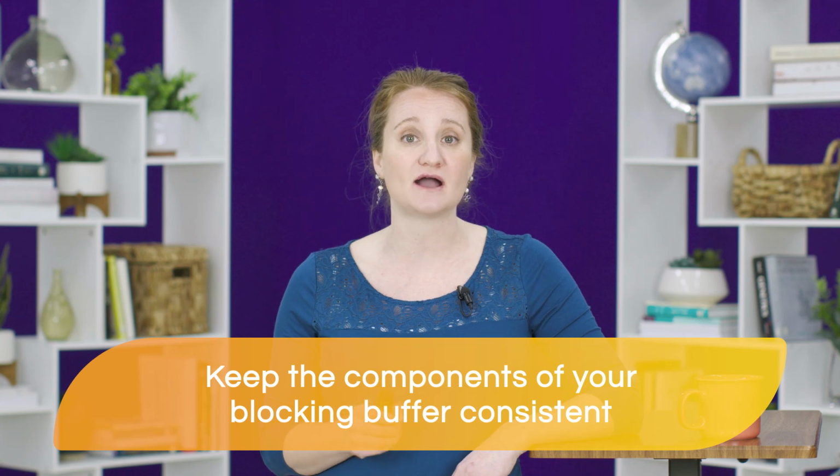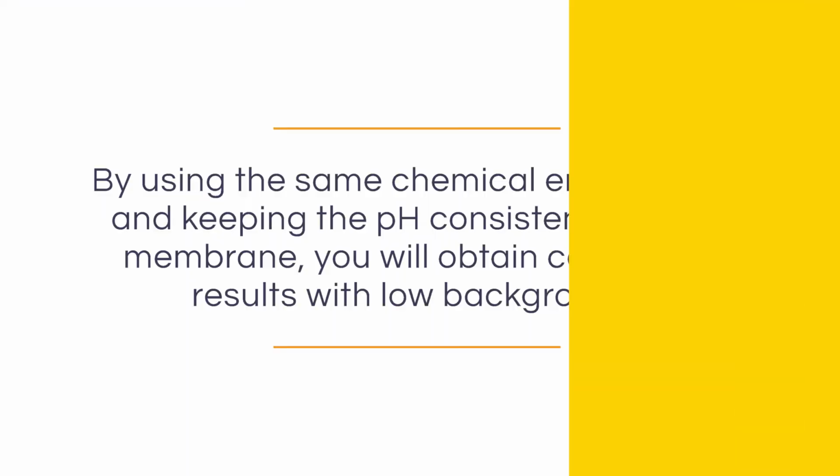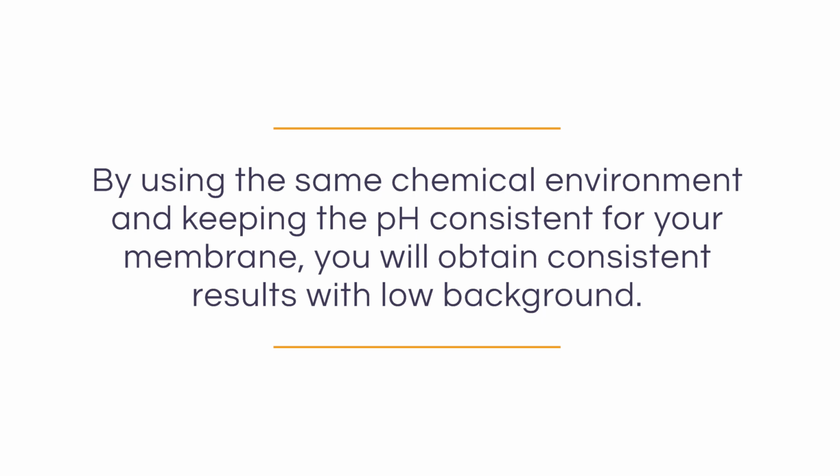Now, regardless of which blocking buffer you use, you should use the same components of your blocking buffer to make your primary and secondary antibody solutions. For example, if you use a PBS-based blocker, be sure to use that PBS as your buffer base for your antibody dilutions and washes. The same goes for TBS. By using the same chemical environment and keeping your pH consistent for your membrane, you will obtain consistent results with low background.